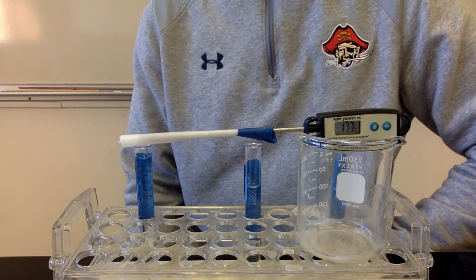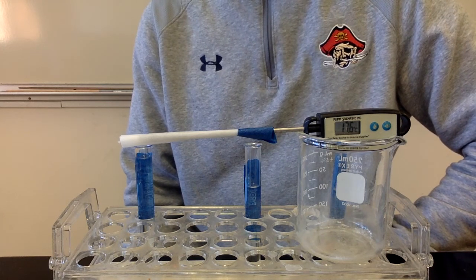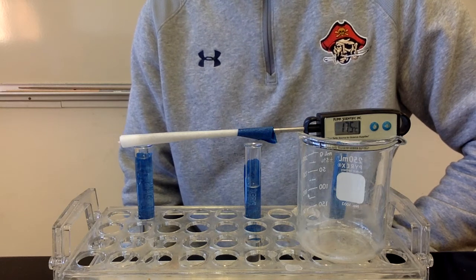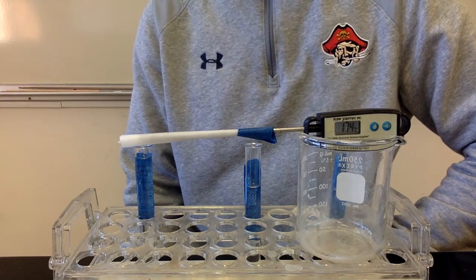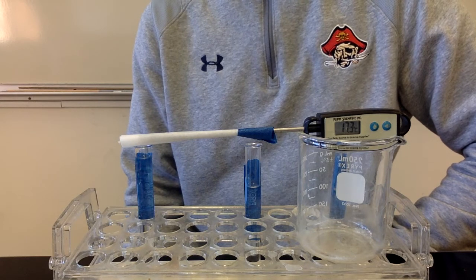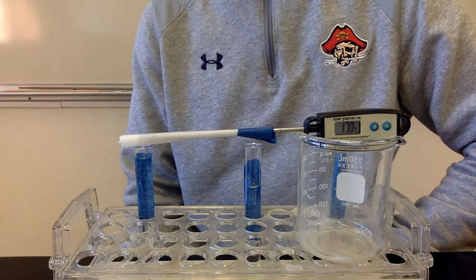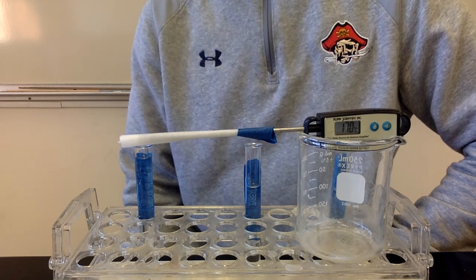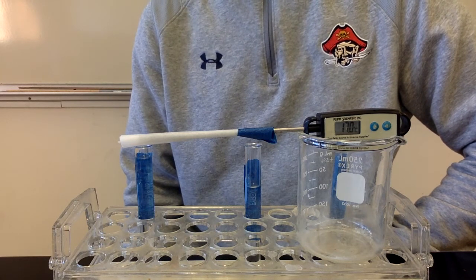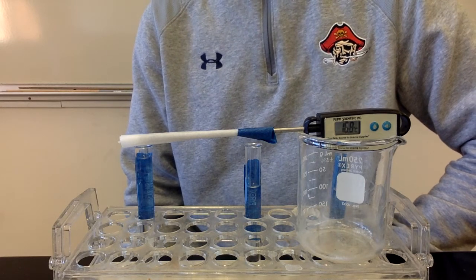And so every 30 seconds, you need to record the temperature. At the end of this, you're going to be making a graph. And so on your graph, you're going to have time on your x-axis. And you'll record a piece of data every 30 seconds. So along your x-axis will be time. And then on your y-axis, you'll have temperature. And so you'll see how the temperature changes over time.